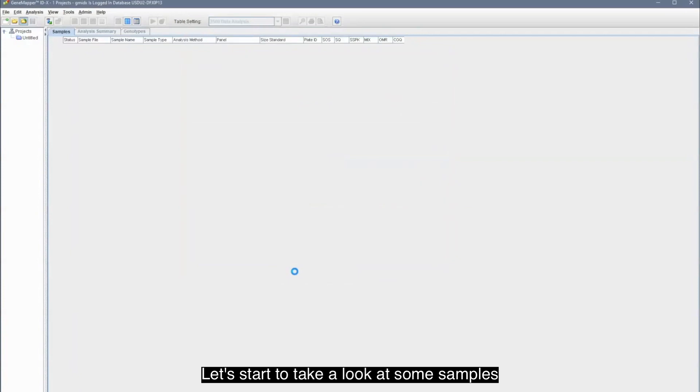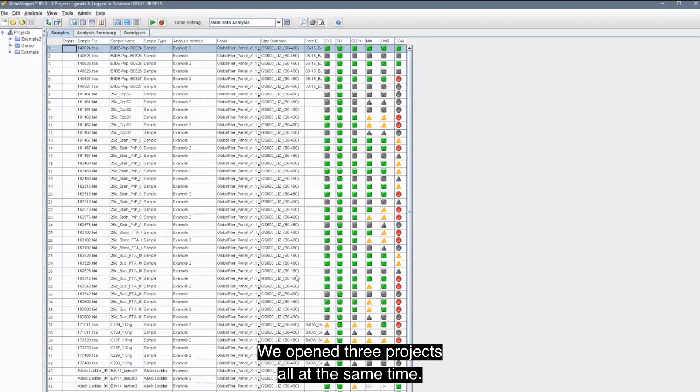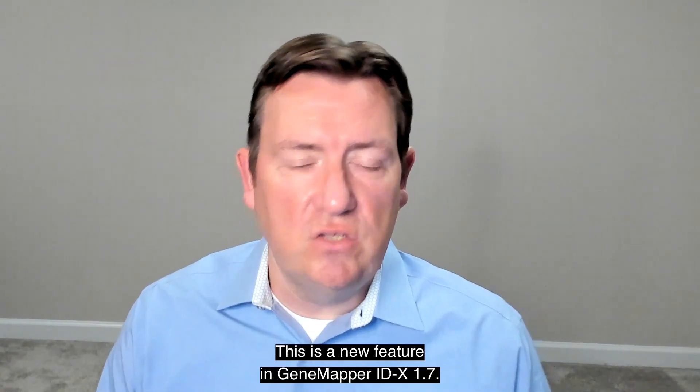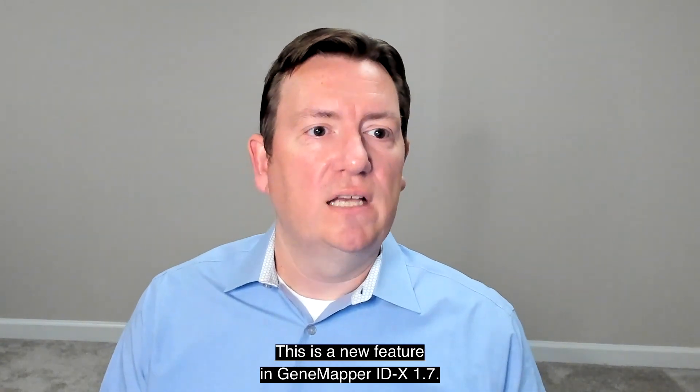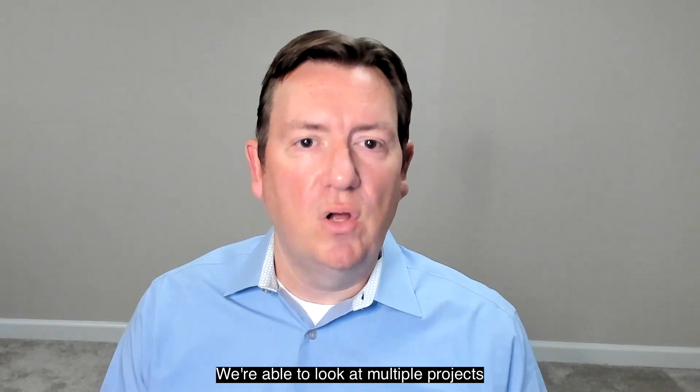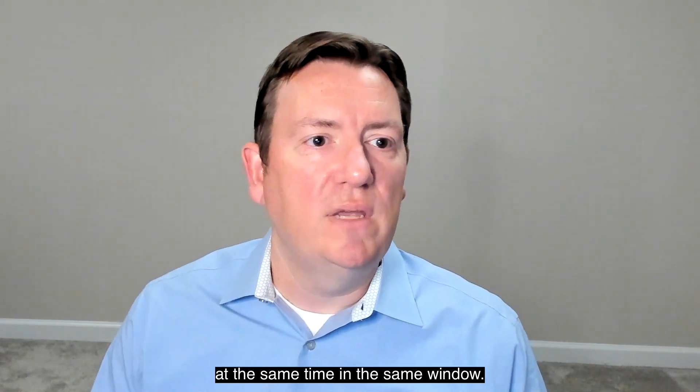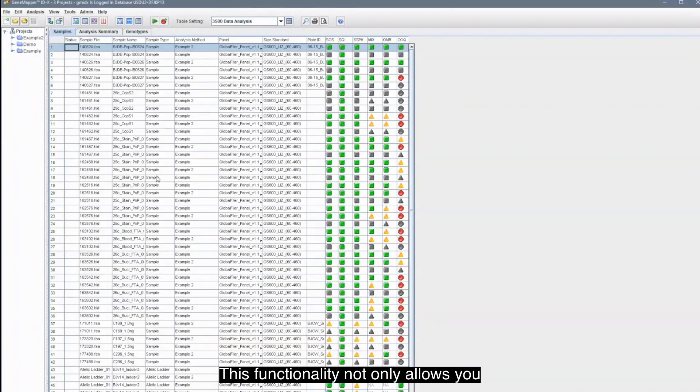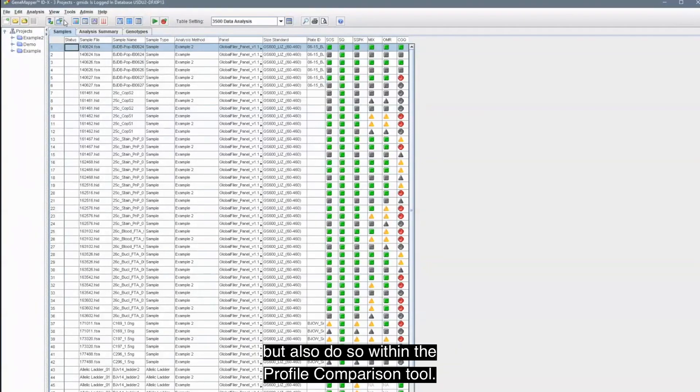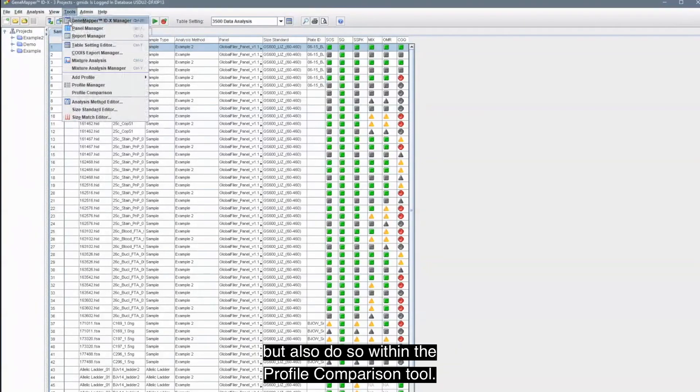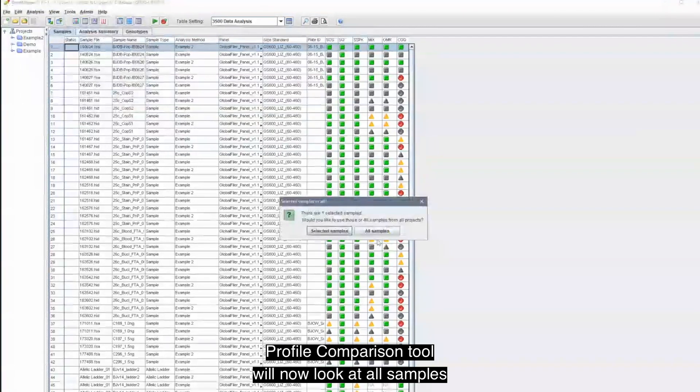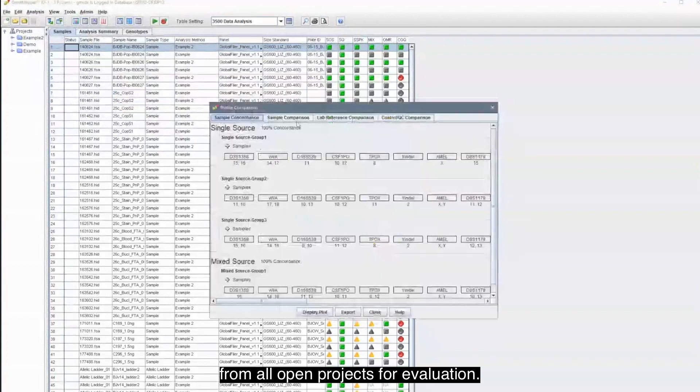Let's start to take a look at some samples within the software now. Your eyes didn't just deceive you. We opened three projects all at the same time. This is a new feature in GeneMapper IDX 1.7. We are able to look at multiple projects at the same time in the same window. This functionality not only allows you to manually compare samples across different projects, but also do so within the Profile Comparison Tool.